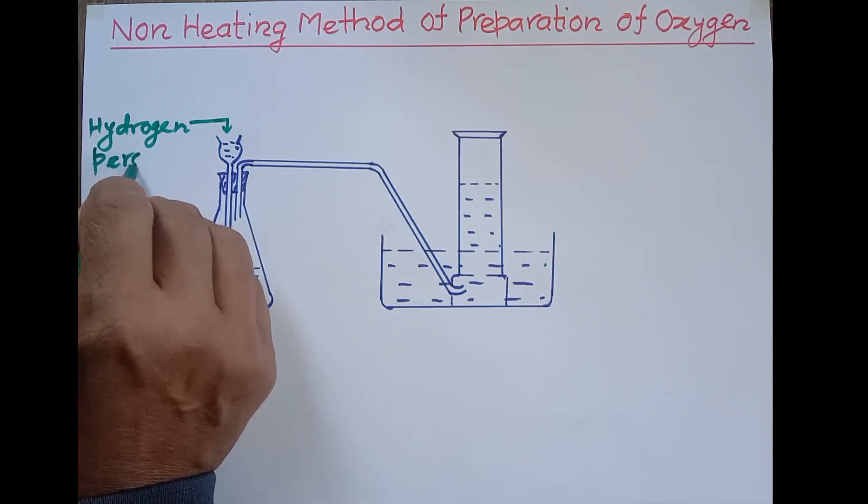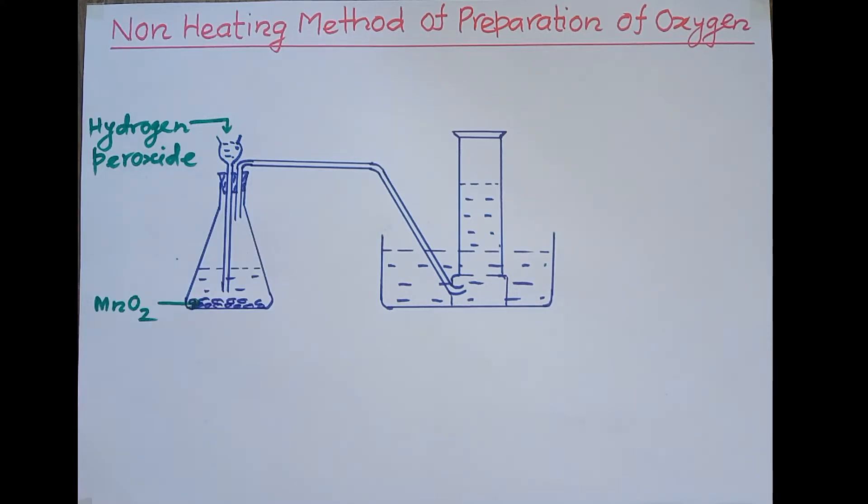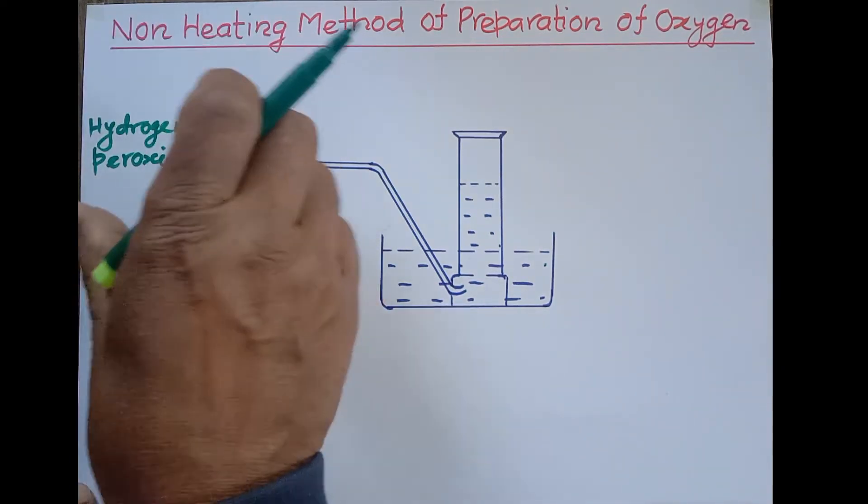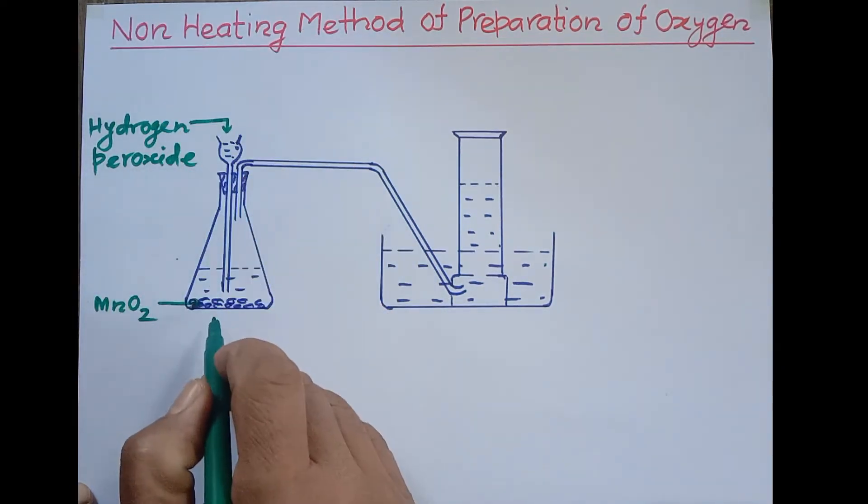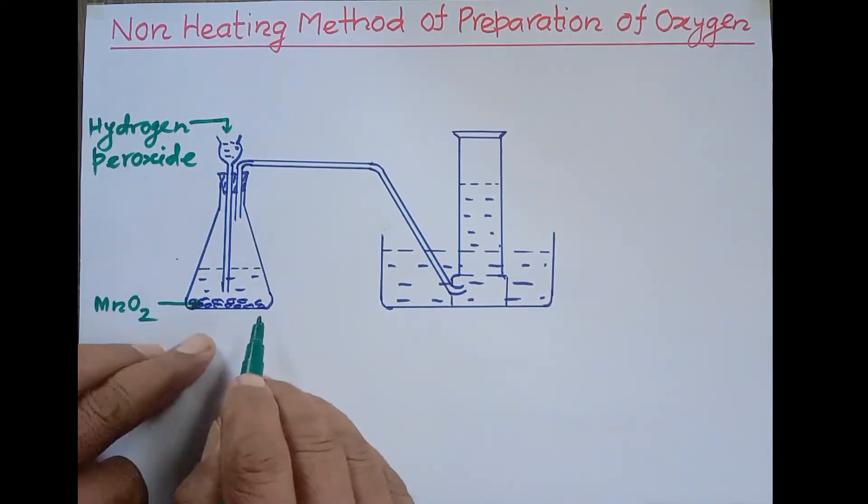The liquid is hydrogen peroxide. This is hydrogen peroxide, a liquid which appears like water and is an unstable compound. This hydrogen peroxide is poured from the thistle funnel.